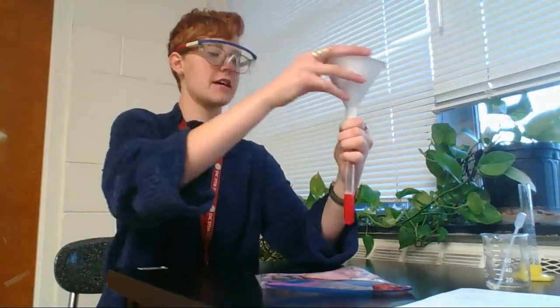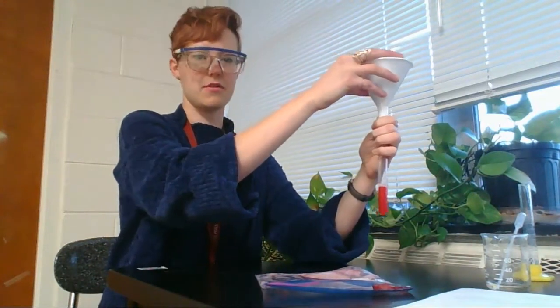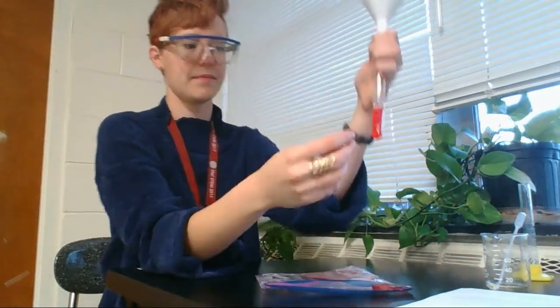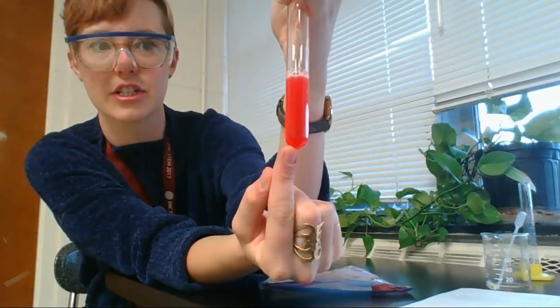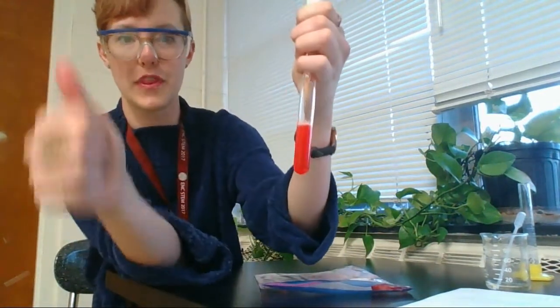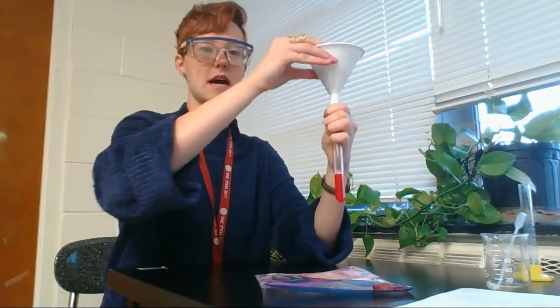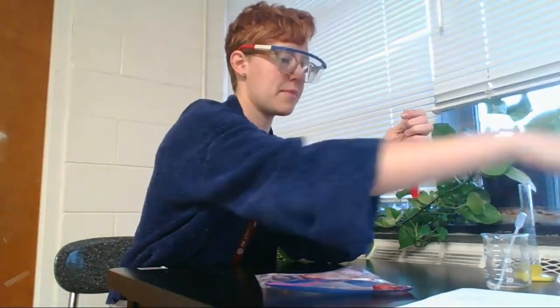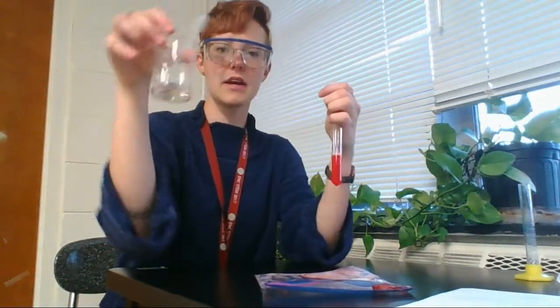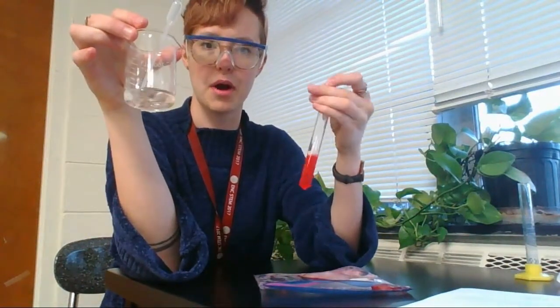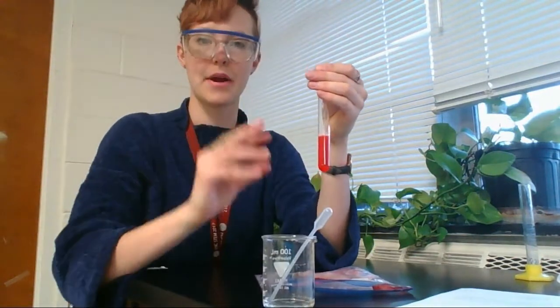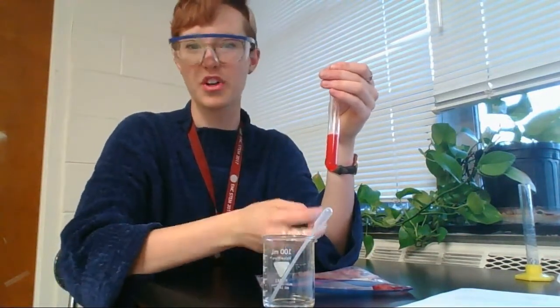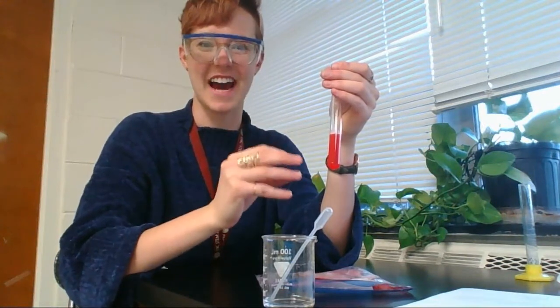For our very last step, I'm going to take my funnel, set it to the side. Notice how there's not really chunks in here, it's just liquid. That is a good thing. I'm going to put it to the side on top of my paper towel because it's going to get messy. And last but not least, I'm going to take my isopropyl alcohol. Isopropyl alcohol will separate our DNA from all the other molecules and all the other guts inside of our test tube. So I'm going to take my little pipette here and I'm going to add several, several drops.